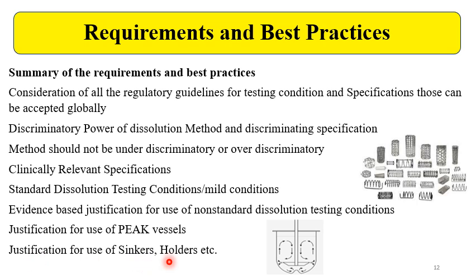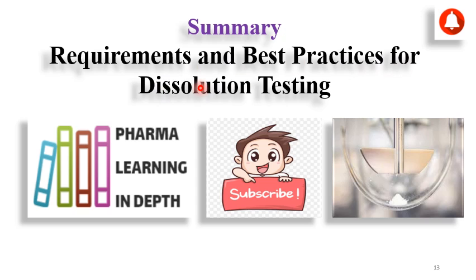Justification for the use of sinkers, holders, and the baskets for the dissolution. Sometimes the sinkers are used, sometimes the tablet holders are used, sometimes other auxiliaries are used for dissolution testing for some of the ER products or the other products which are having some modification or technology for the solubility enhancement. That time these justifications are required. So this is regarding the requirements and the best practices for dissolution testing.